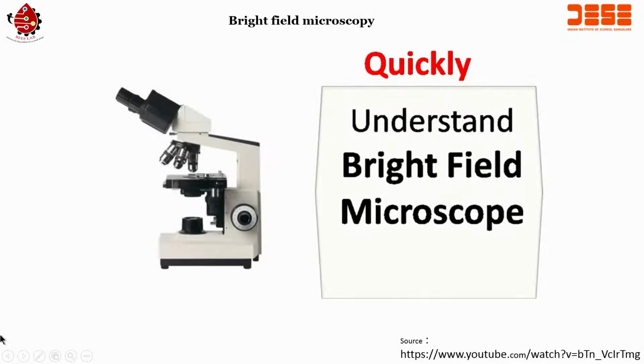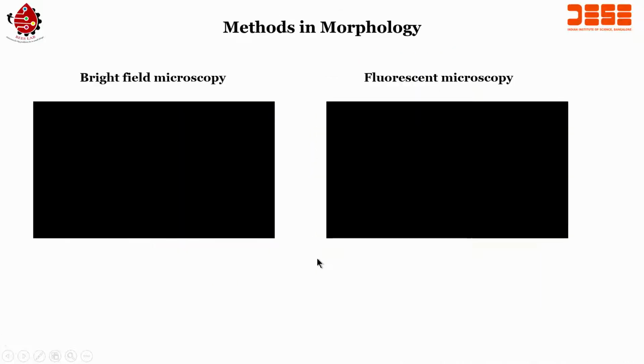Now, since you have used the bright field and seen the bright field microscopy, let us also see the fluorescent microscopy, and let me play the fluorescent microscopy as well.